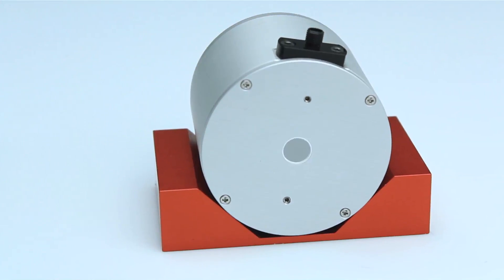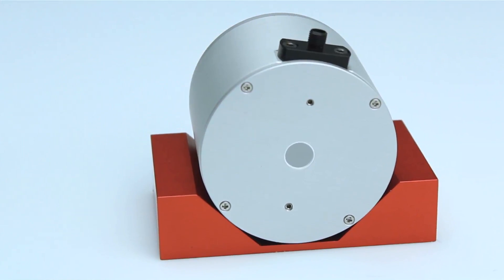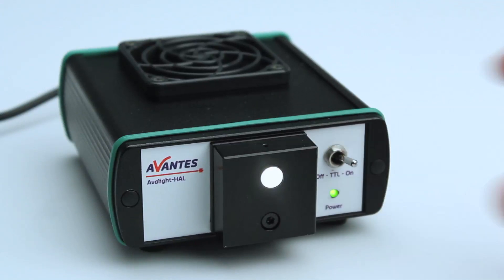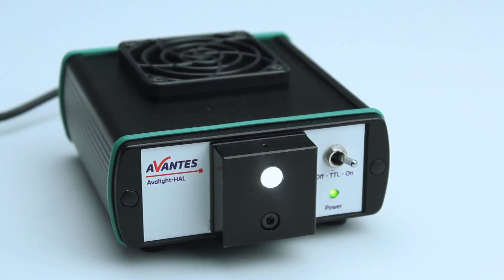In this case, we will use an integrating sphere. Be aware that the Avantis halogen light source needs to be warmed up for 15 minutes to have a stable output of the lamp.